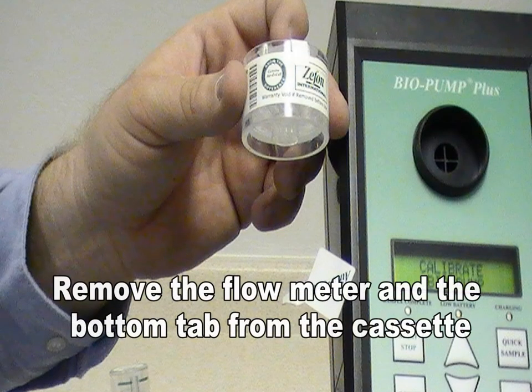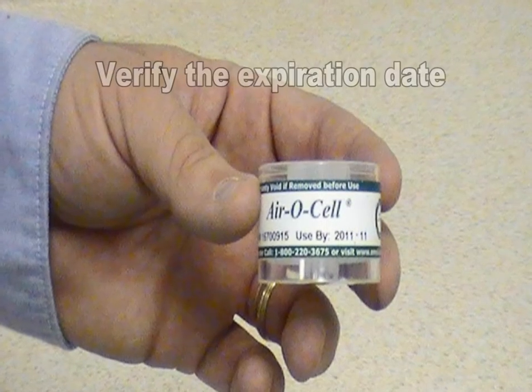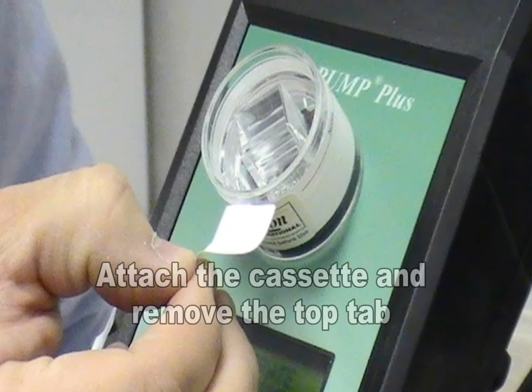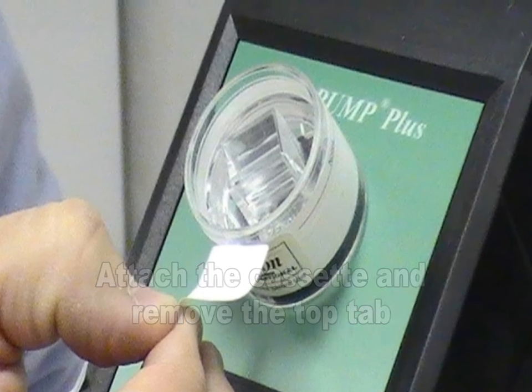After calibration, remove the flow meter and remove the bottom sticky tab from the Aerosel cassette. Save this tab and be sure to also verify the expiration date of the cassette. Attach the Aerosel cassette to the circular area on the pump, then remove the top sticky tab and save for later use.